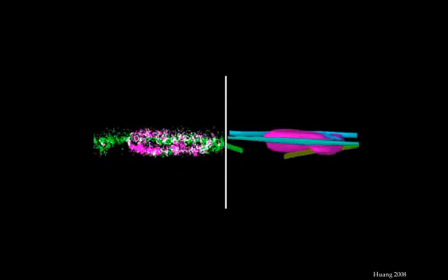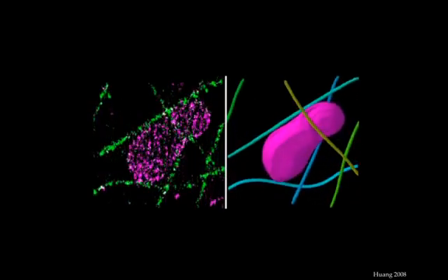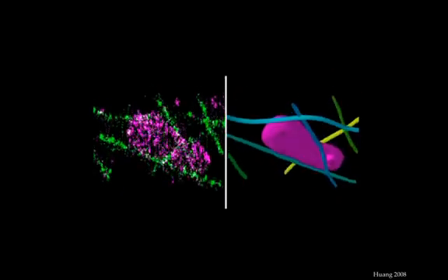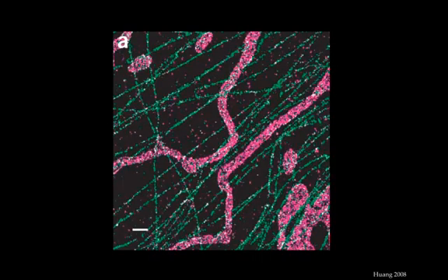Additionally, there were some complex interactions, such as multiple or overlapping microtubule-mitochondria contacts that we wouldn't be able to resolve with light microscopy. And so we needed this resolution in order to study the interactions of the tubular mitochondria with microtubules. They make pretty complex contacts, and they're not just lying flat on the microtubules. And so we actually even see some off-and-on type of contacts, making a sort of inchworm-like shape on the microtubules. And with light microscopy, again, this would just be a smear, and we'd lose any of the nice fine details we get with STORM.